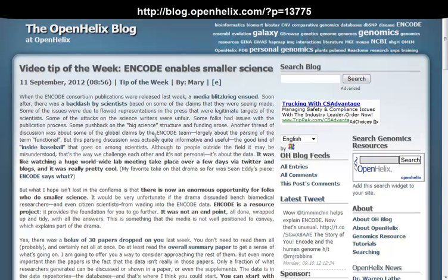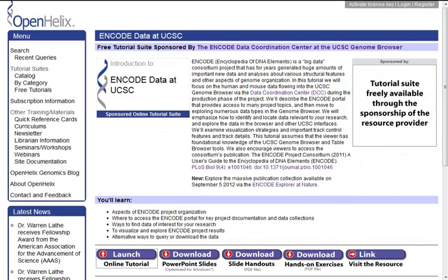If you have a topic that you're interested in, you may find new data in these genomic regions that the ENCODE team has generated. I want you to be able to check this out, and that's what I'm hoping to illustrate here today. Come by our blog post, read this, and I'll give you more details about how to do that. But what I wanted to illustrate first is that one of the things that can help you is that we've got a tutorial that explains step by step how you can take your browser and start looking for ENCODE data in the UCSC Genome browser.